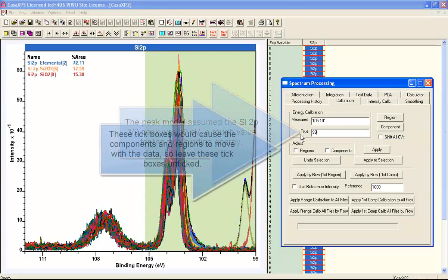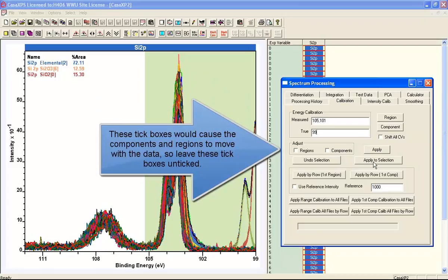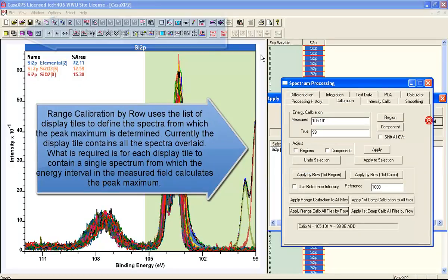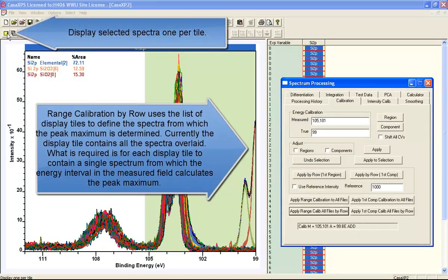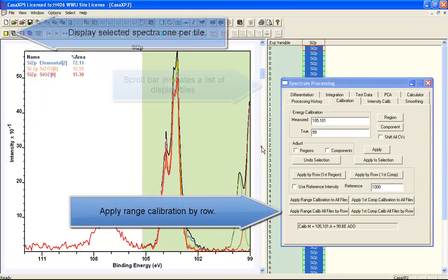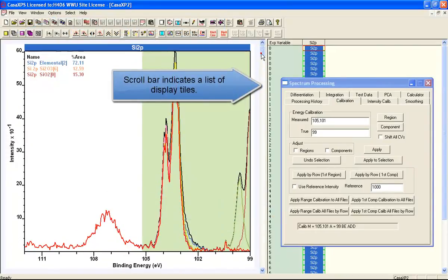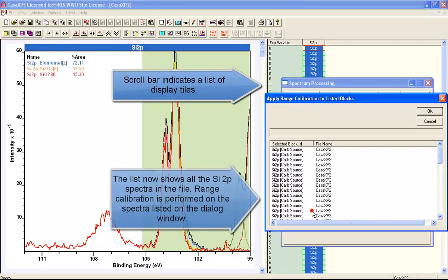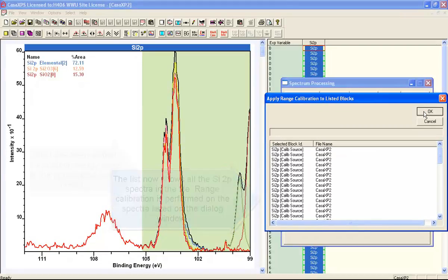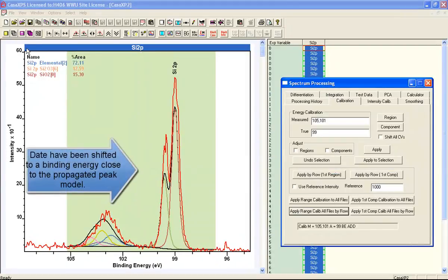In order to do this, we first need to calibrate the spectra and align the elemental silicon, because this ought to be in the same position in binding energy for all of these data. The peak model was propagated from a silicon 2P spectrum that had been calibrated, but the data set has not been calibrated in terms of binding energy. So before we can fit the peak model to these data, we need to perform a rough calibration.